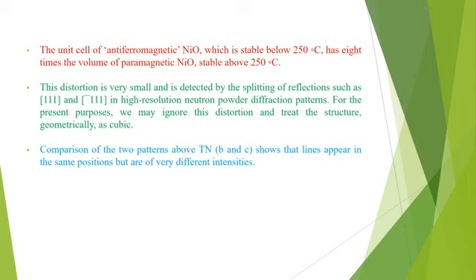The neutron powder diffraction pattern for manganese oxide, which behaves very similarly to nickel oxide, below and above the Néel temperature TN, together with a schematic powder X-ray diffraction pattern at room temperature, are shown in the following figure.